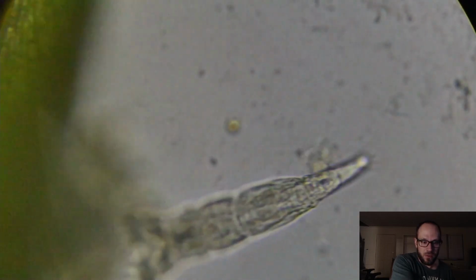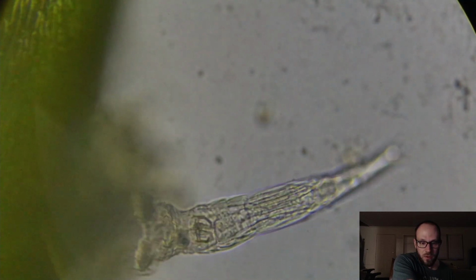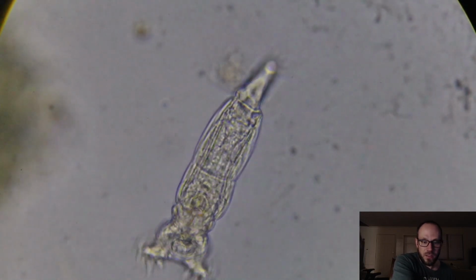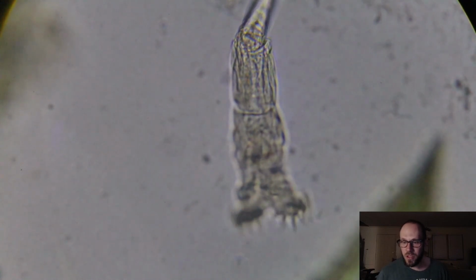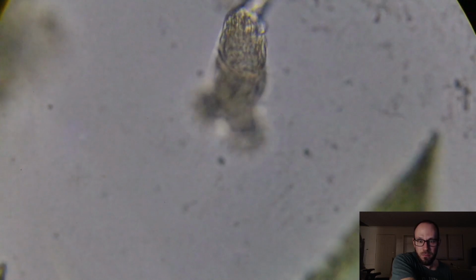Yeah, this slide's so cool. All it needs to be complete is freaking tardigrades, but can't have it all. So this organism is actually a form of plankton. Freshwater plankton. And yeah, this is all from a piece of moss that I got from my driveway. So rotary motion, bringing in a vacuum. Yeah, it's creating a water current that just kind of filters little dead particles into it.